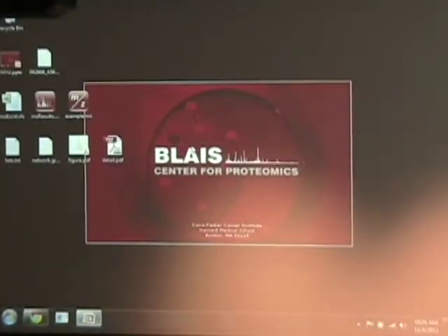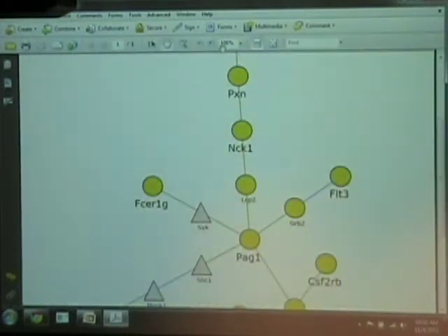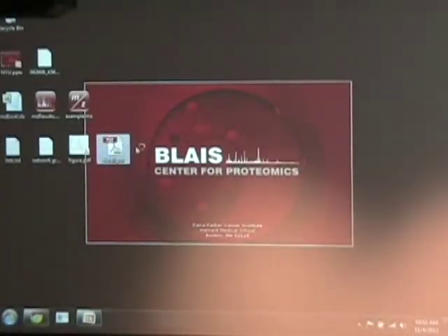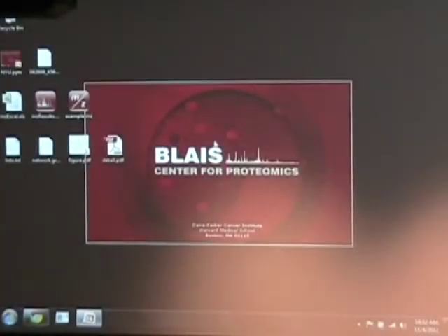There's a lot of support on Pathway Palette that I showed you earlier for storing things like the networks. It's vector graphics, so you can put them in publications. And if you're using MZD, for example, remember we looked at spectra. You can basically store them. A lot of people wanted PDF support, so little things like that, but it's beyond the scope of an introductory talk.